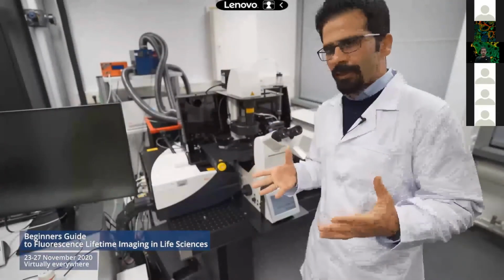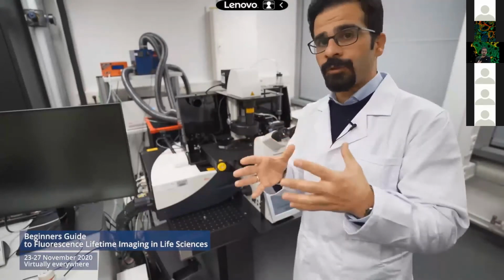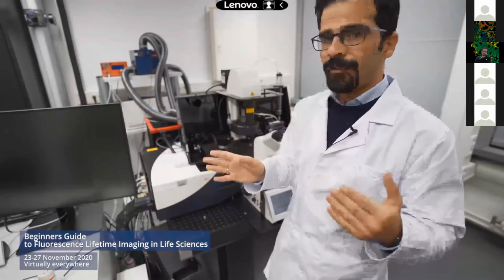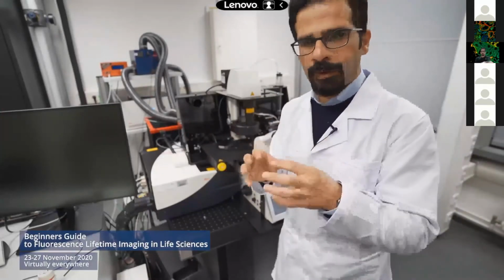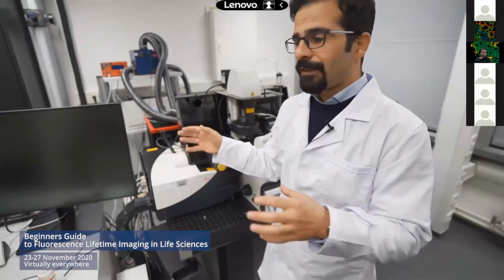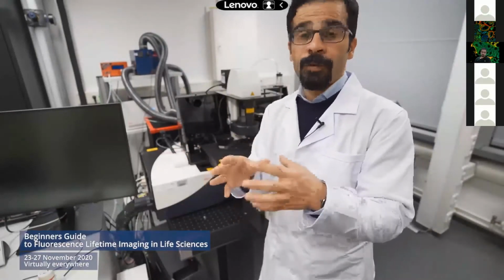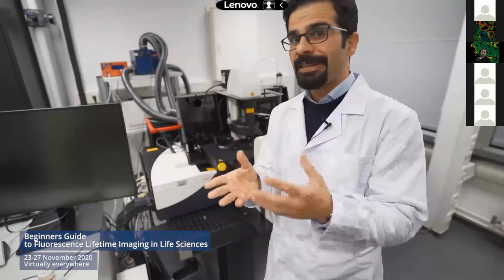The excitation light is split from the detection of fluorescence that we are interested in collecting using the AOBS. The fluorescent light then travels through the pinhole, which can be adjusted to have optimal confocal imaging, and then it is guided toward the detection unit. The internal detectors offer fully spectral confocal imaging. What we have here are 5 detectors.